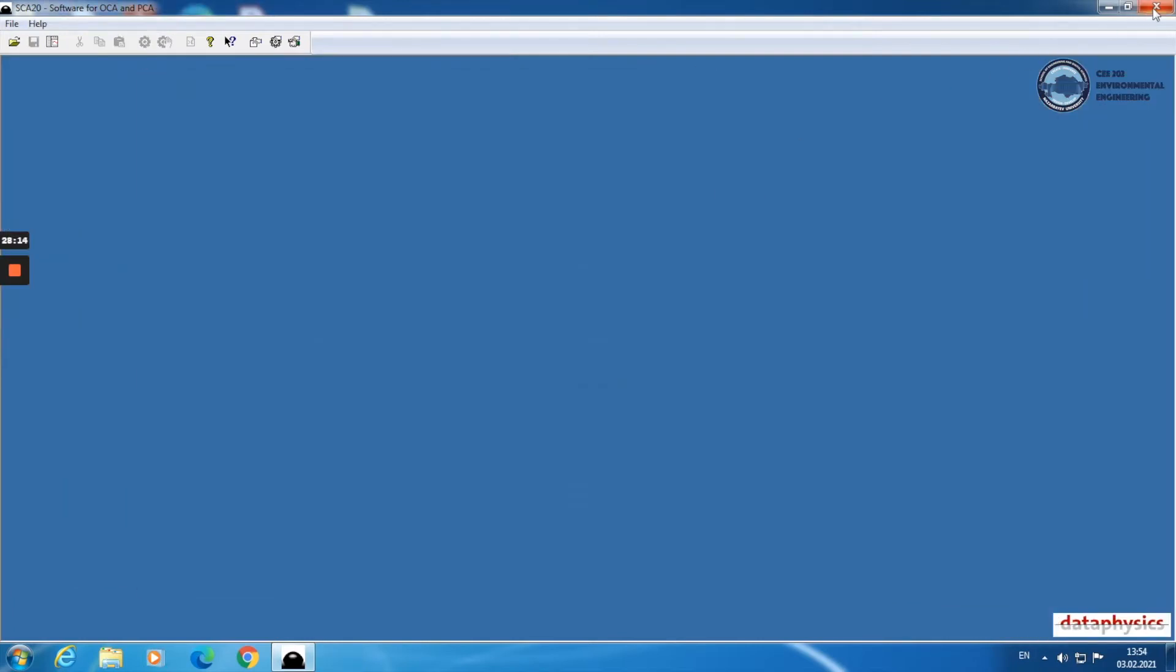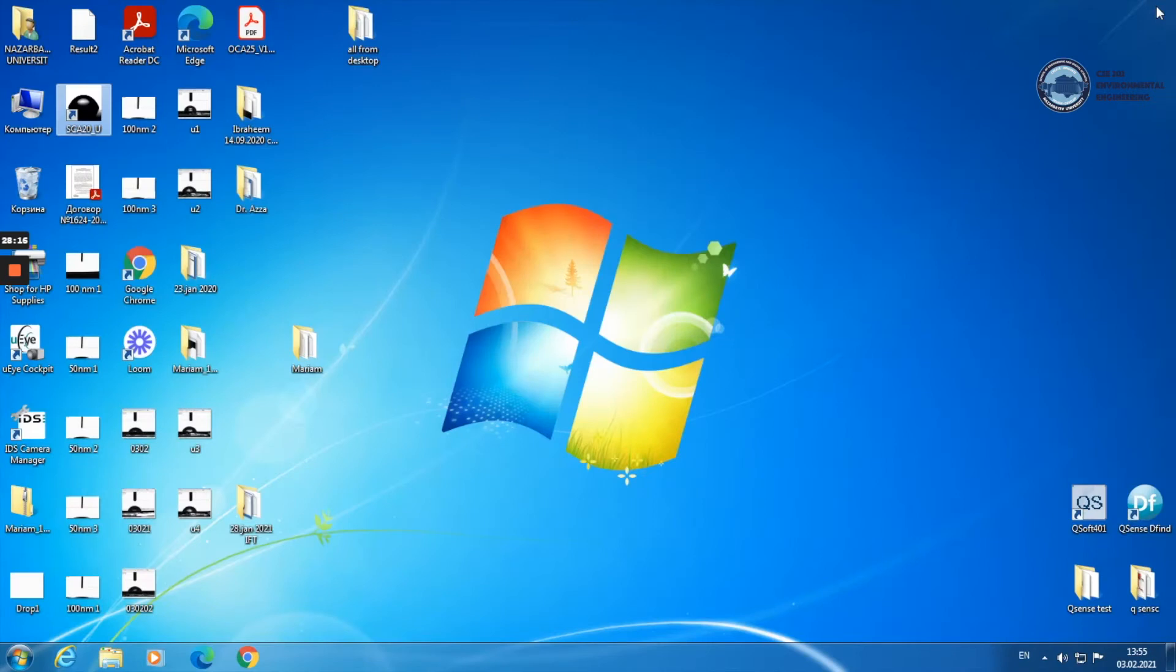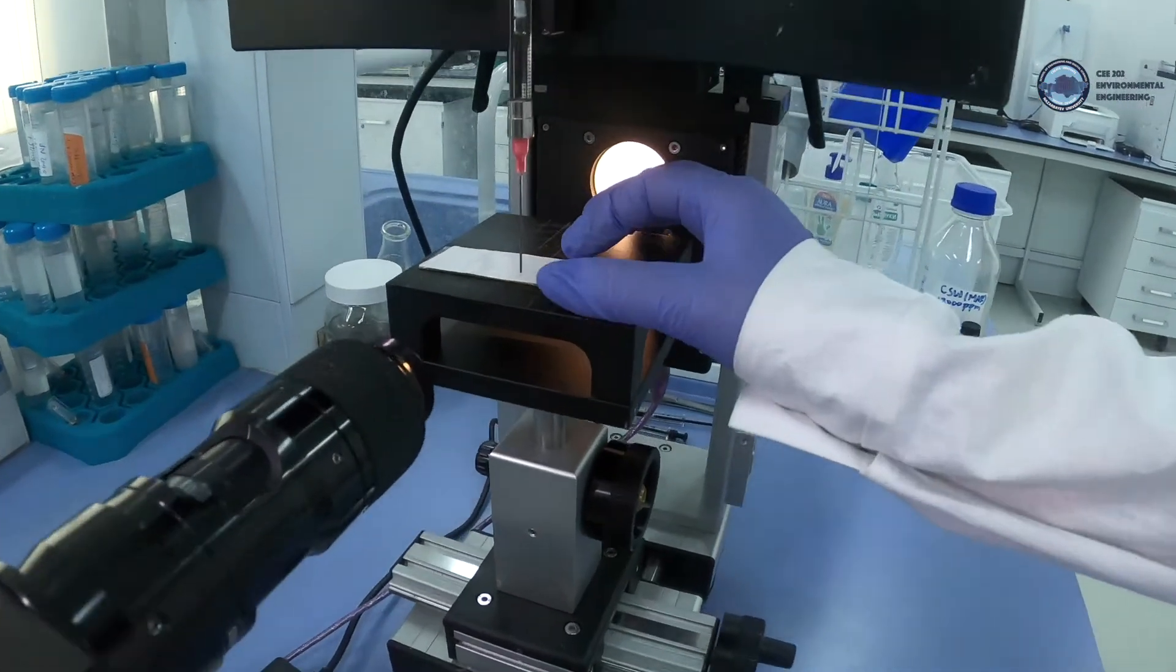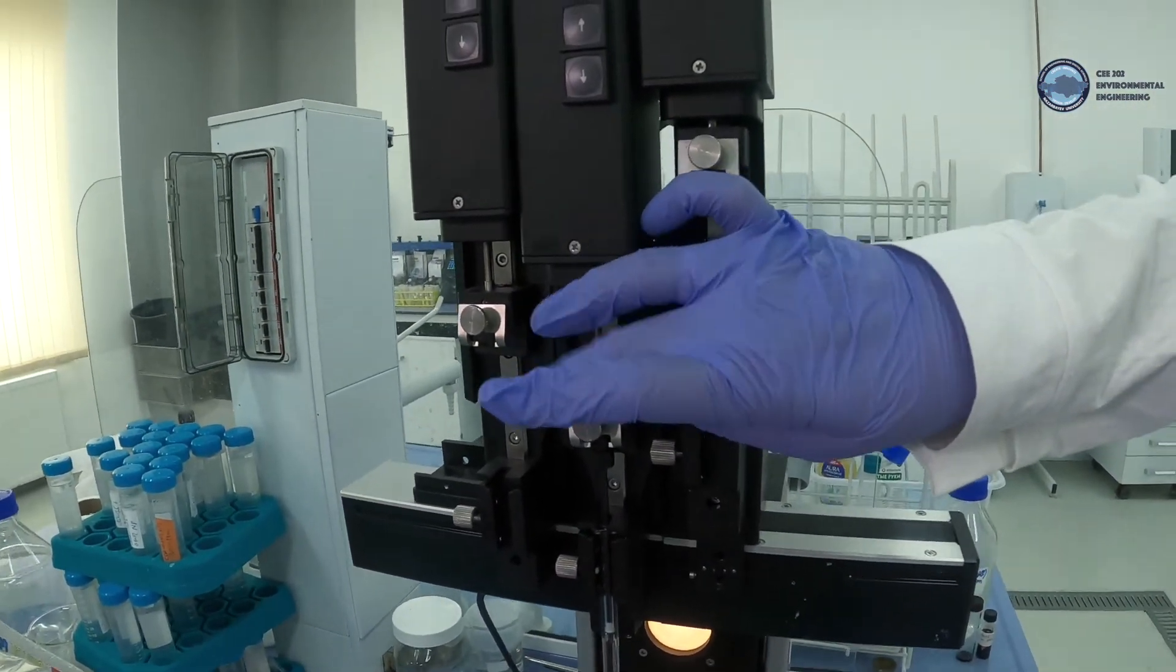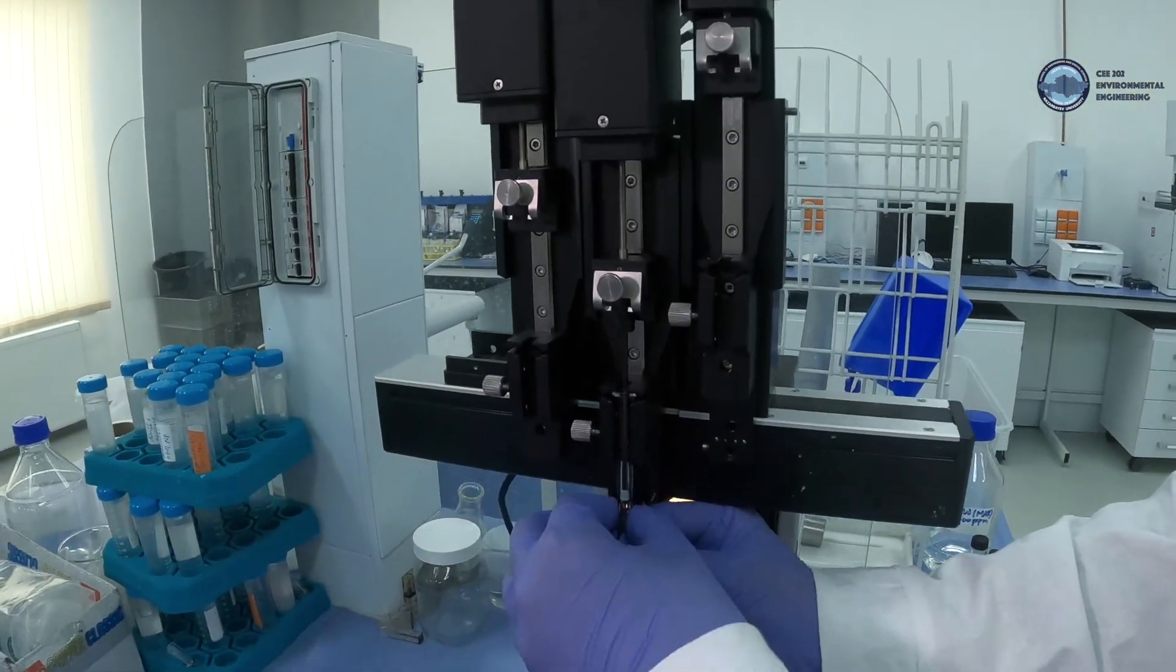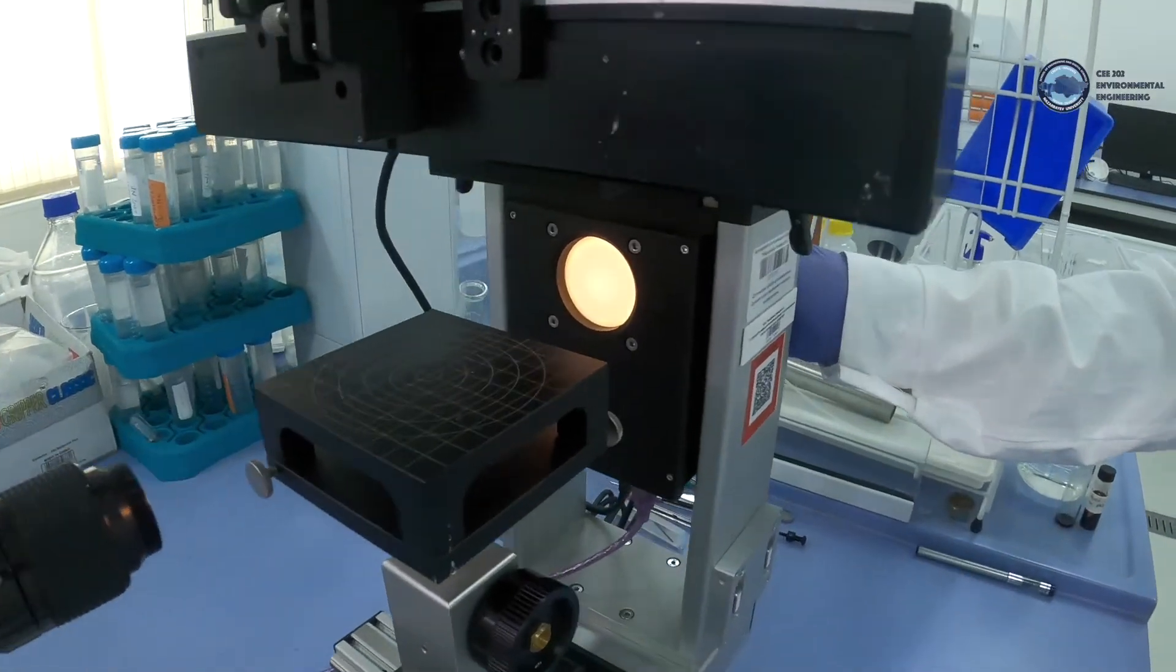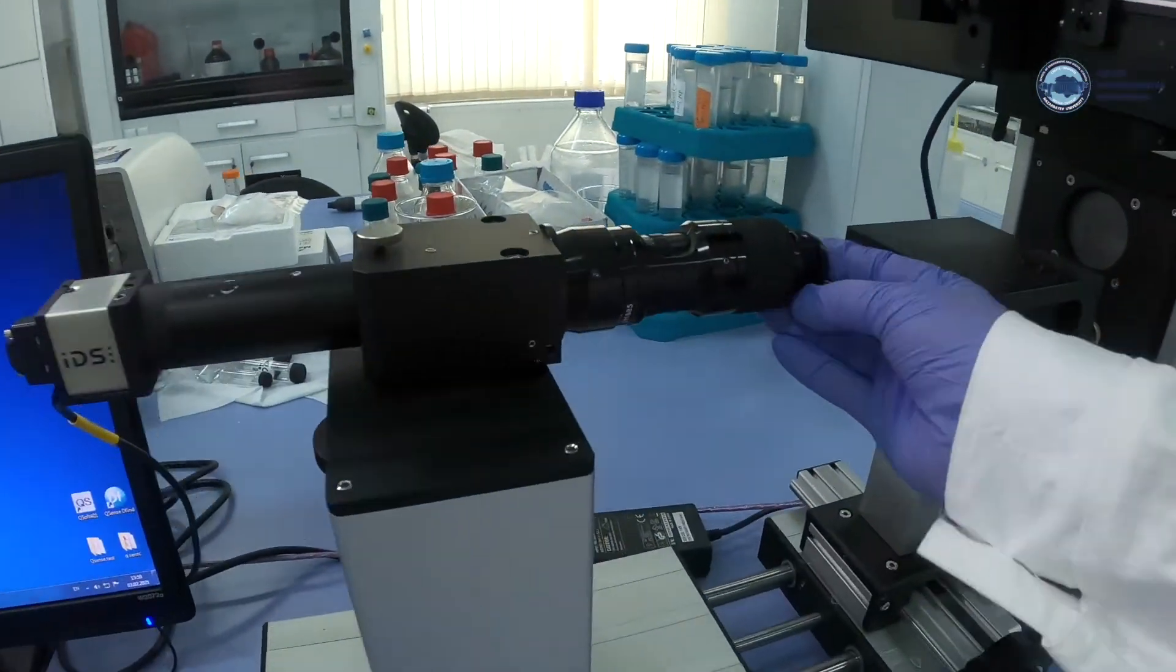After we finish all measurements, we close the program, take out our fouled membrane from the device, loosen the screws of the equipment to pull out the dosing syringe, switch off the light and close the objective.